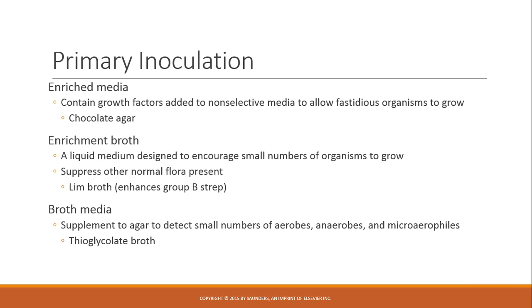Enriched media have added nutrients to allow the growth of fastidious organisms. Fastidious organisms means hard to grow. They need some extra nutrients. So chocolate agar is our most common enriched media. We can also use an enrichment broth.